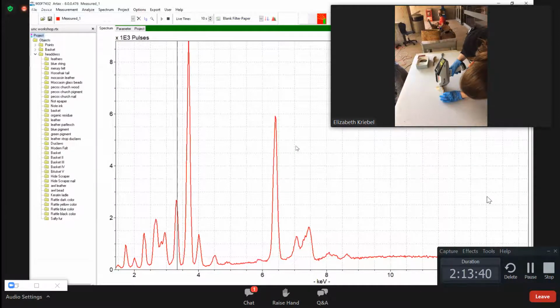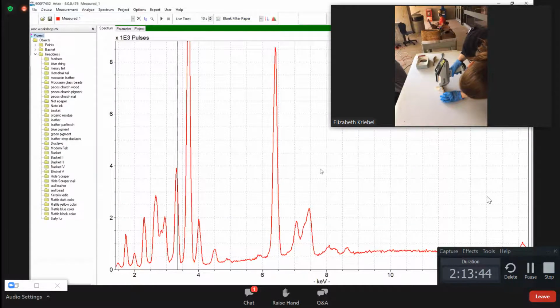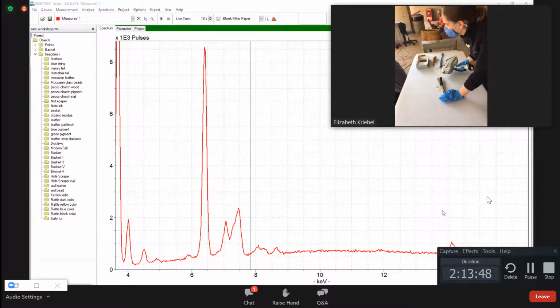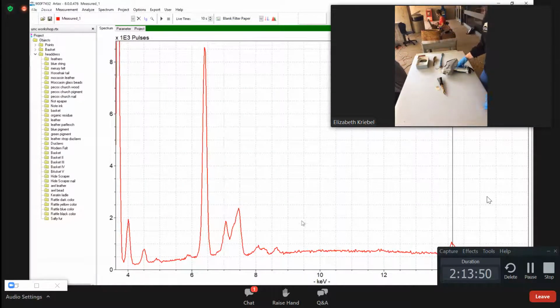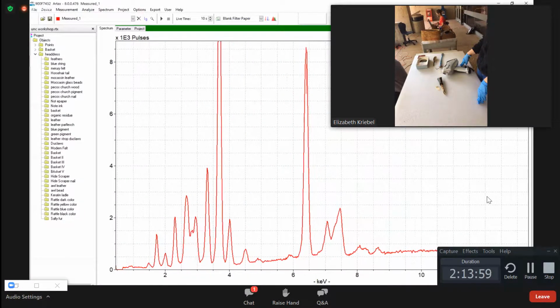So no salt on this guy, on this portion of it anyway. That's incredible that it's so localized. Yeah, a lot of care went into making this thing. No chlorine on this guy. Iron, potassium, calcium. Perfectly normal material. So a lot of care went into making this.